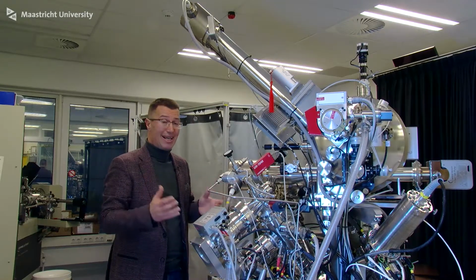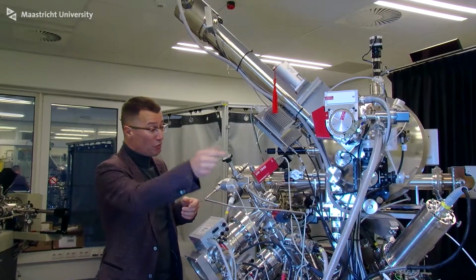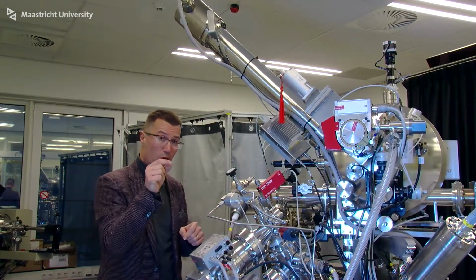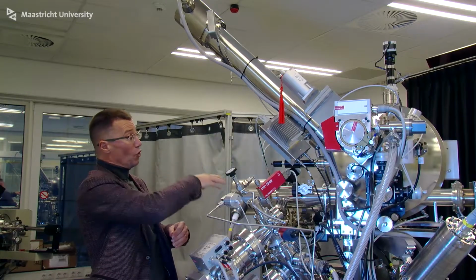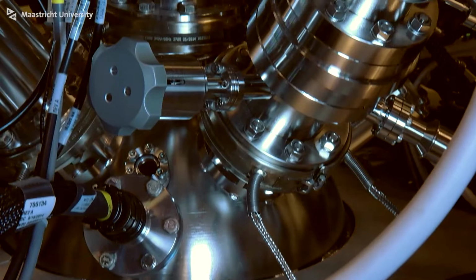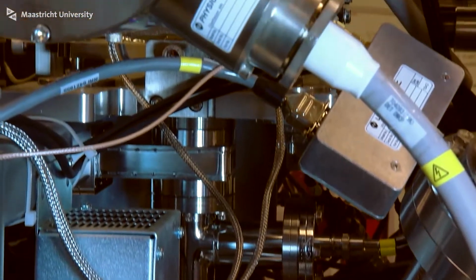So here we are at the highest resolution mass microscope on the Brightlands Maastricht Health Campus. In this instrument, we use 3 particle accelerators to focus ions down on a spot of 50 nanometers. There they cause an explosion and they allow ions to fly through that drum onto this detector right here. With this mass analyzer, we are able to look at the chemical composition at the square nanometer.